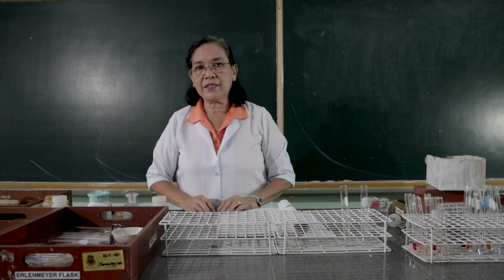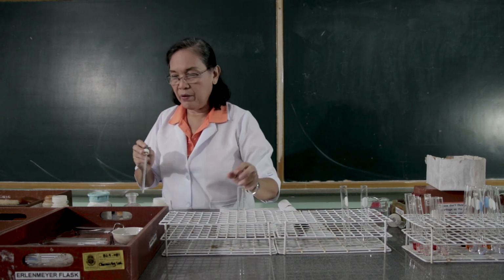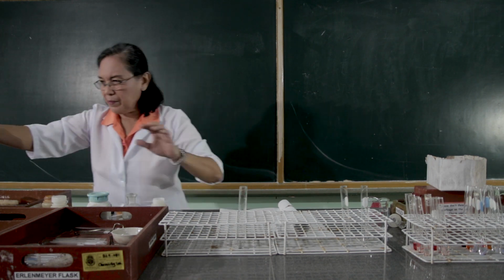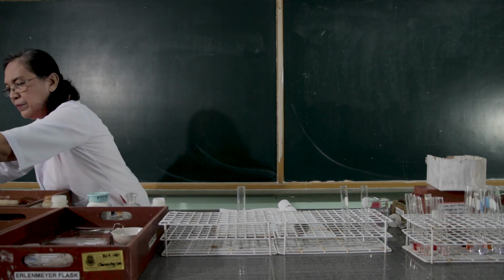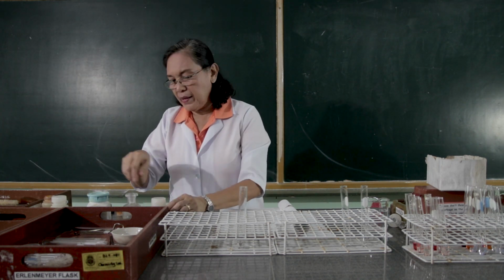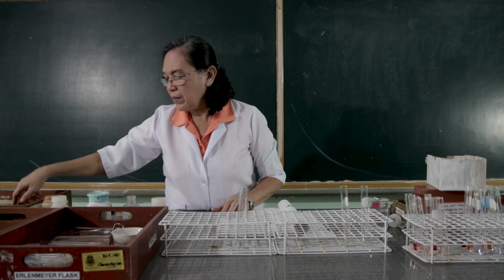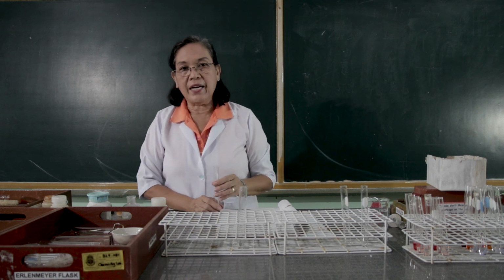So let's get some amount of the hydrochloric acid. And we will also get some amounts of the acetic acid.